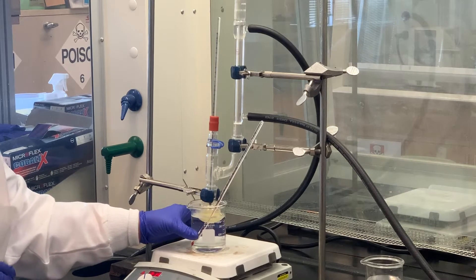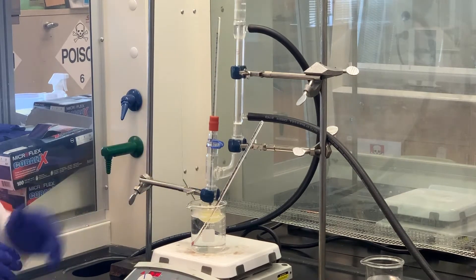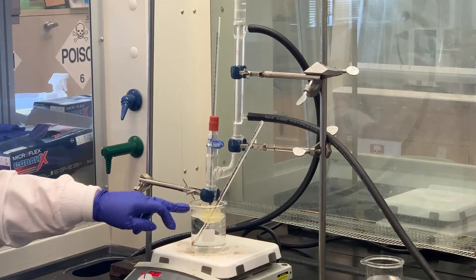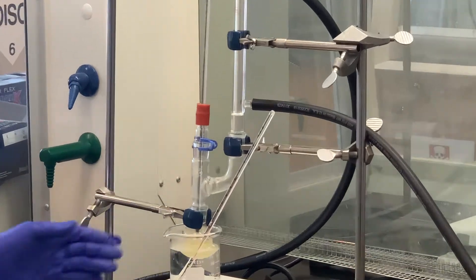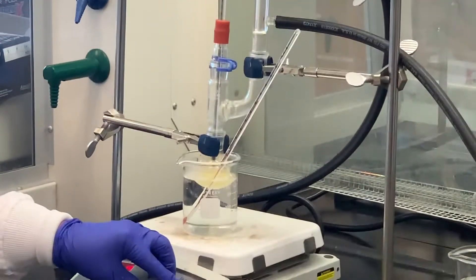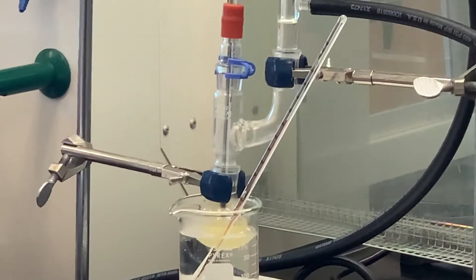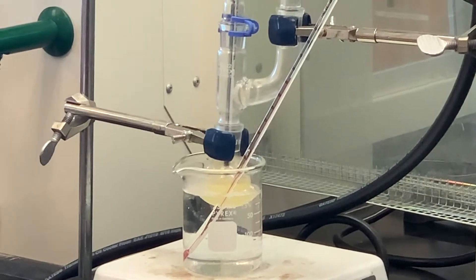Once that 15-minute time period is over, we will work on isolating the different isomers from that nitration. Notice you can probably see that it's very cloudy — there is some solid formation. That's normal; that means the reaction is going. The stirring mechanism may not be going great, but it's moving somewhat, so as long as we have some stirring going on, we should be good as far as the reaction is concerned.